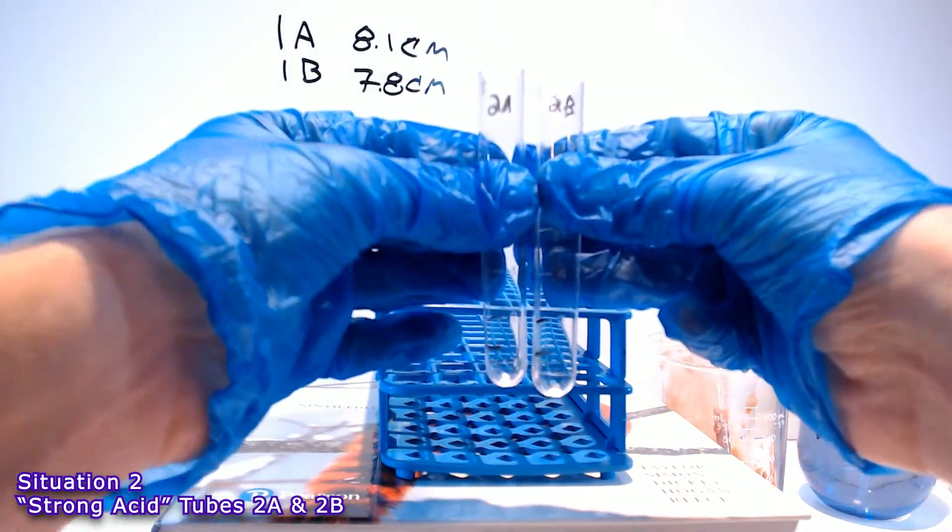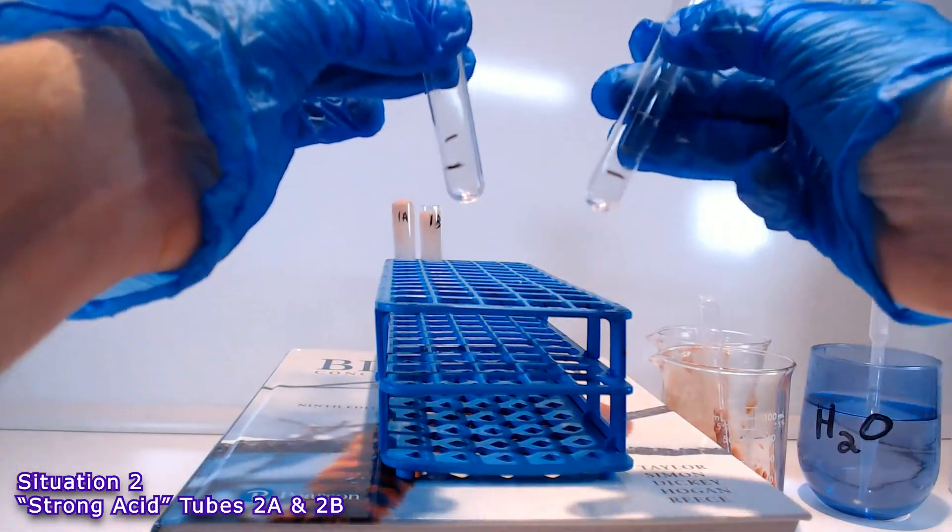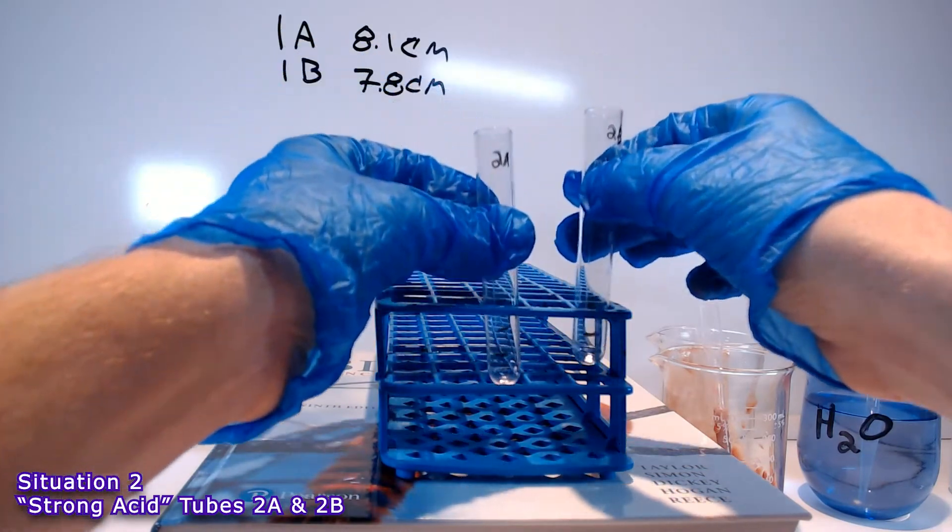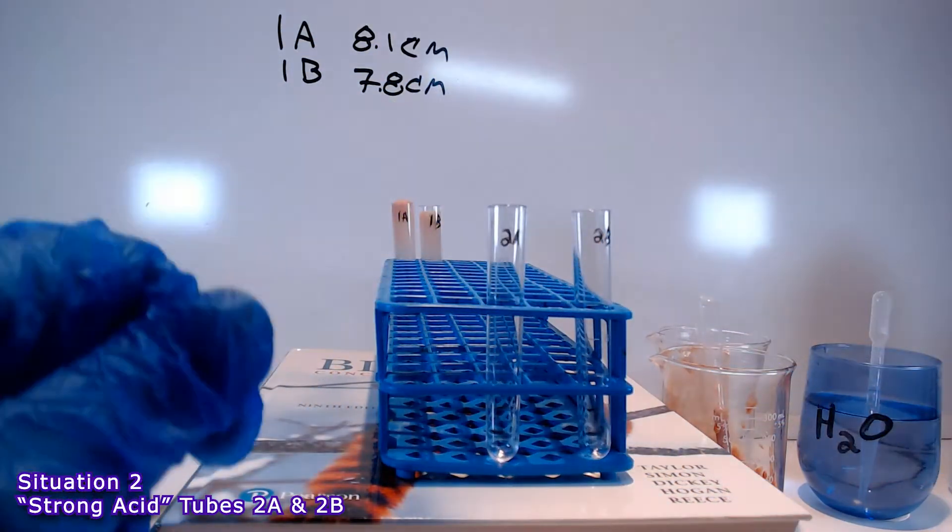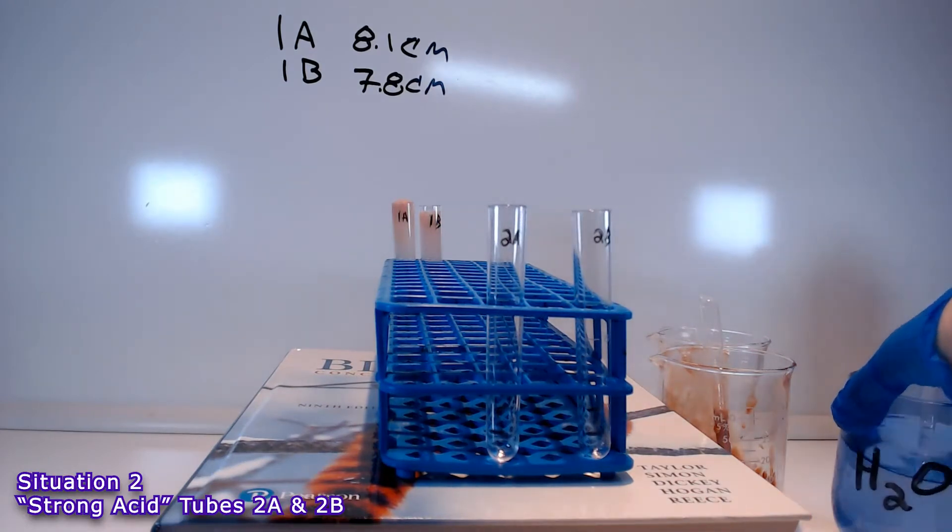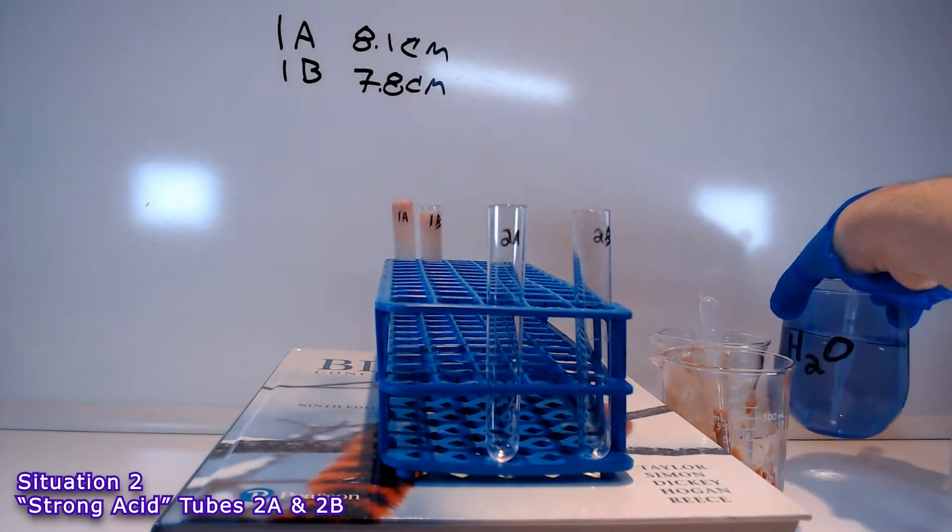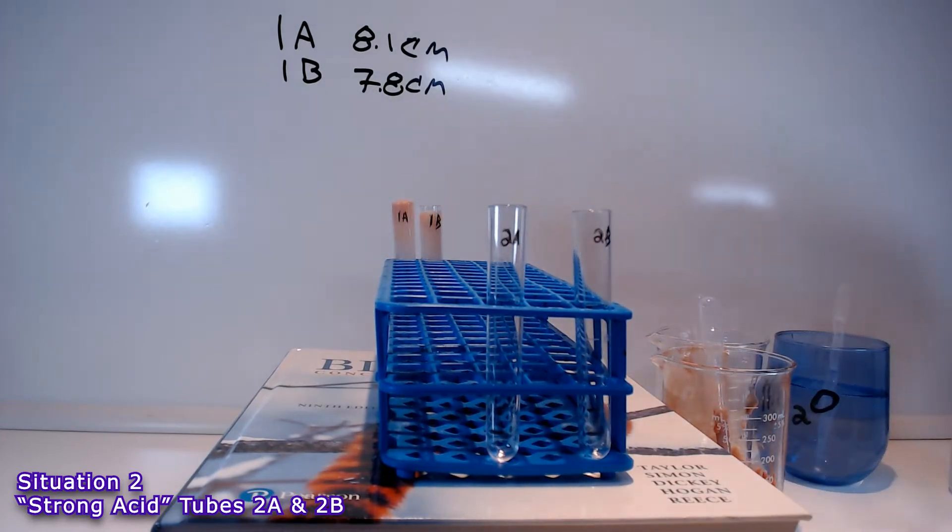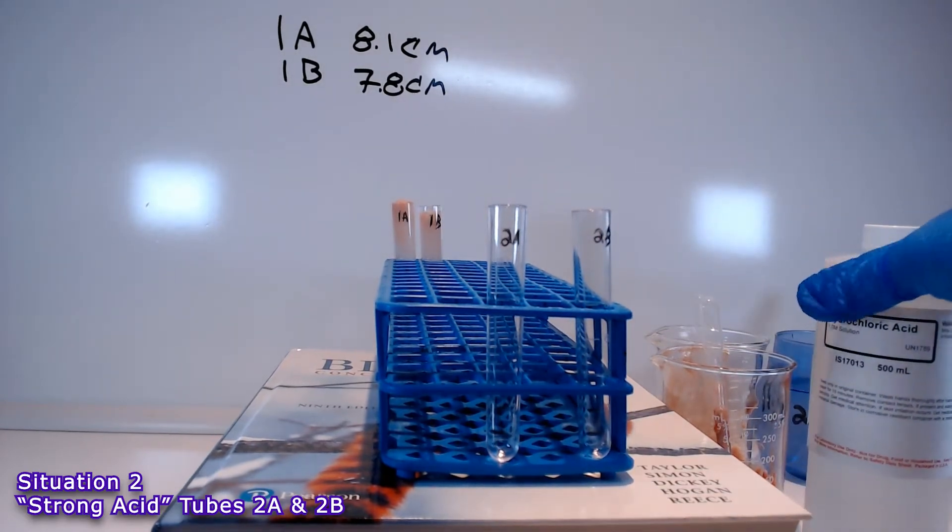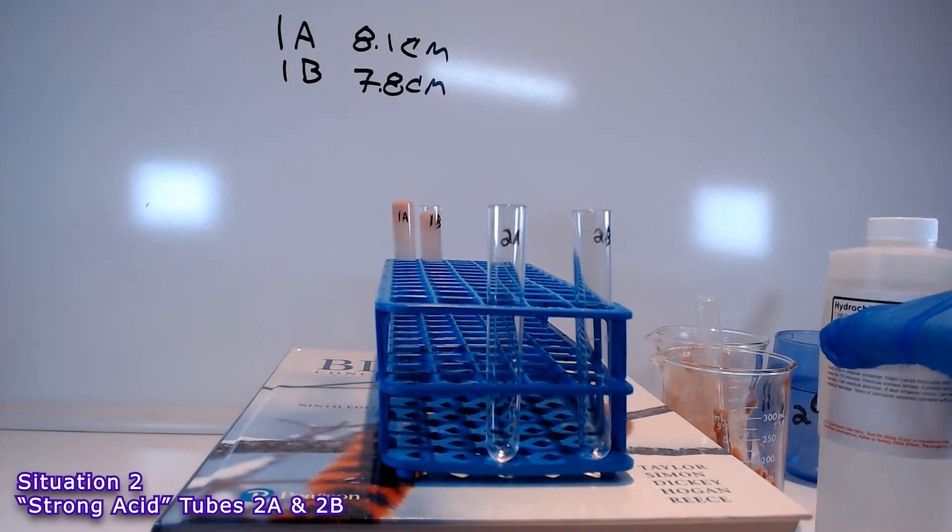Now we have test tubes 2A and 2B, and they're set up in just the same way. There's a mark 1 centimeter from the bottom and 2 centimeters from the bottom. Instead of adding water to the 1 centimeter line, in situation 2, we want a low pH. The instructions call for sulfuric acid, but I don't have any on hand, so I'm going to use hydrochloric acid instead. Still a strong acid.